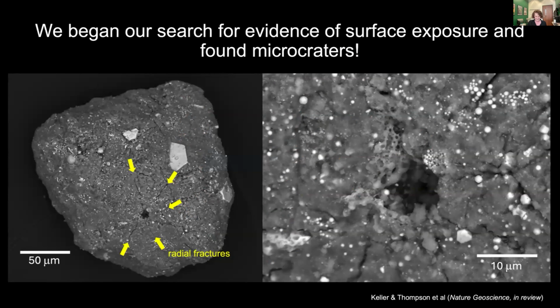So we started looking at the sample in the scanning electron microscope, and we found our first evidence for surface exposure in the form of microcraters. These are craters that form as a result of those micrometeorite impacts, those hypervelocity dust particles that are hitting the surface. So you can see this almost like a hole punched in the surface of this grain from Bennu. There are all these fractures that are running out from the crater.